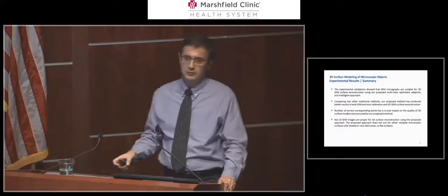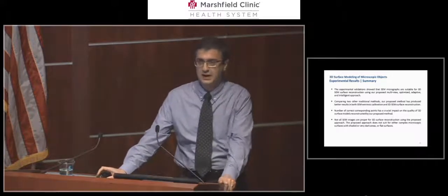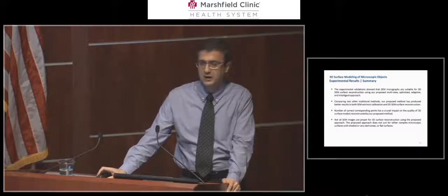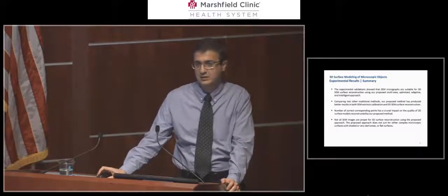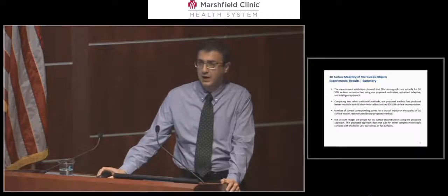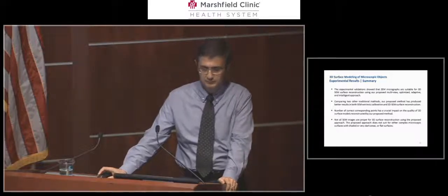In this slide, I'm going to summarize the experimental validations. As you see, experimental validation showed us SEM images are appropriate for 3D SEM surface reconstruction. Compared to two other traditional methods, our proposed method has provided better 3D results and also better results in SEM calibration.